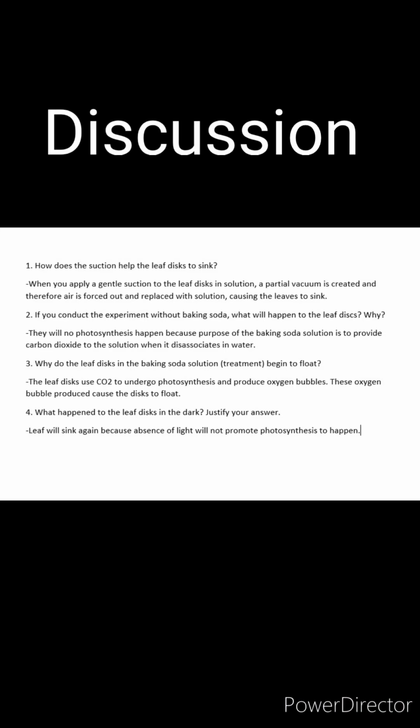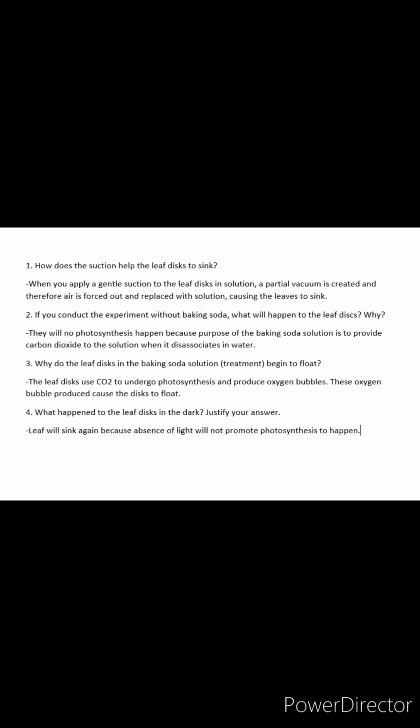Discussion: how does the suction help the leaf disc to sink? When you apply gentle suction to the leaf disc in solution, a partial vacuum is created and therefore air is forced out and replaced with solution, causing the leaf to sink.